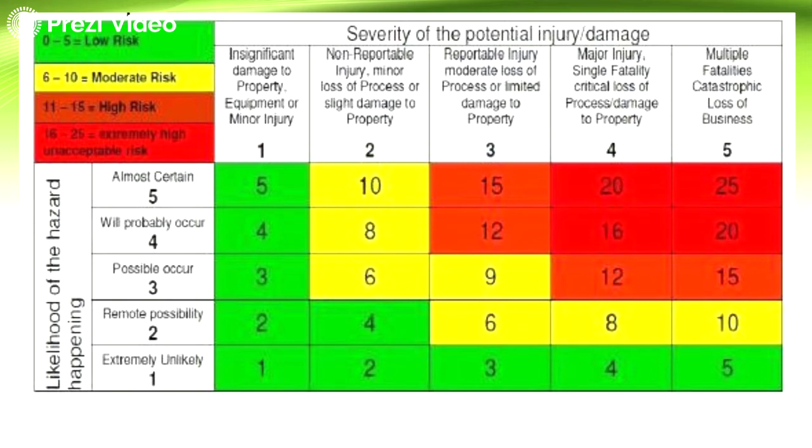'Di ba? Right? Kasi nga multiple fatalities yan. Definitely, dapat lagi kang merong fire extinguisher. Yung mga machine mo, dapat lagi siyang well-maintained, 'di ba? Para hindi magkaroon ng sunog. Okay? And then dapat yung mga staff mo nang tatrabaho, well-trained sila. Kasi kapag walang training ang mga staff na yan, magkakalat-kalat nga ang mga risk dyan. So, it is very fatal. Pwede siya mag-cause ng multiple fatalities.